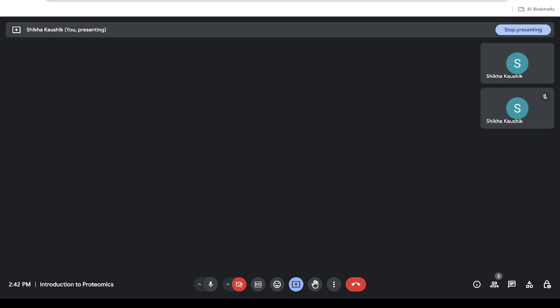Then you have DIA. DIA-MS is data independent acquisition. So data dependent, you are actually selecting your precursors. In data independent, you are not selecting. The survey scan across all isolation windows happens, so you are selecting everything here. No selection is dependent on the MS1 data; you are completely fragmenting everything, and the fragmentation of all the precursors in each window will be analyzed. So you are putting a window.